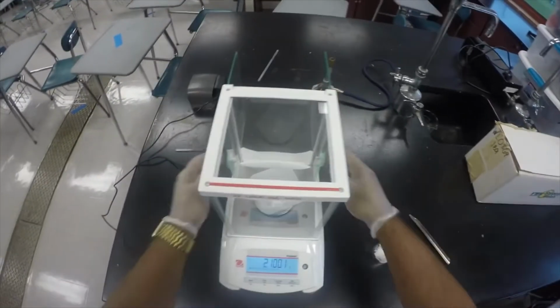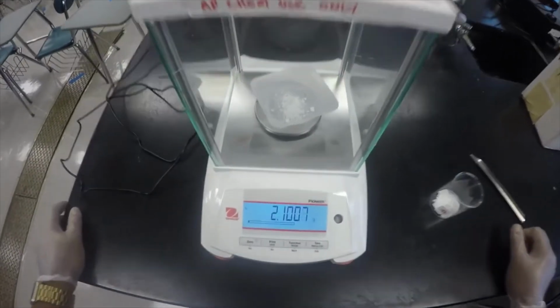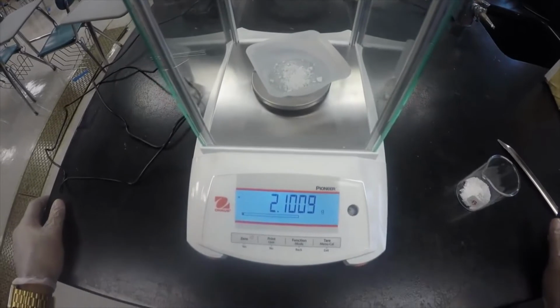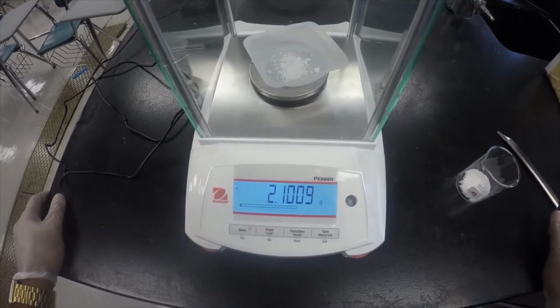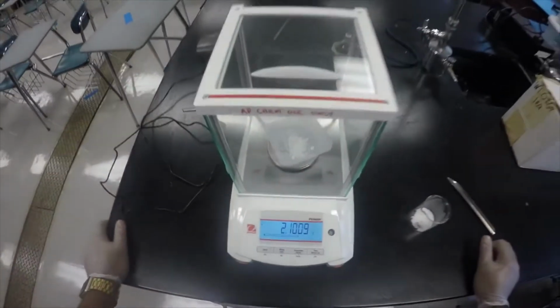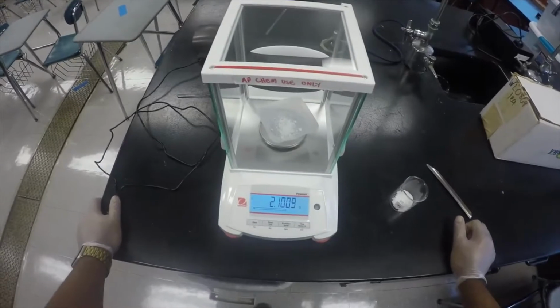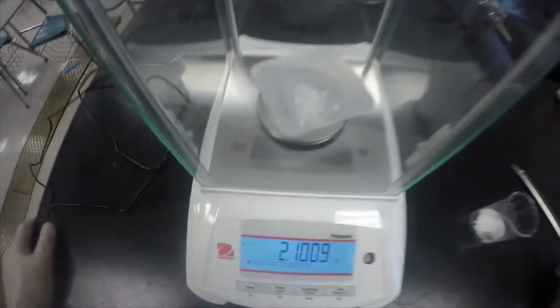Okay, so I'm a little bit over. That's okay. Let me just close the door so you can see that. So notice that that is about 2.1009 grams.